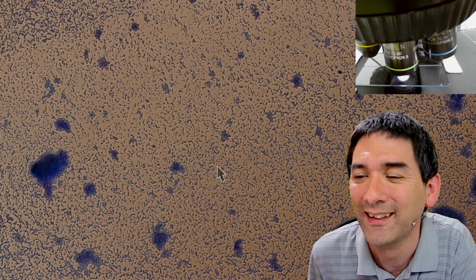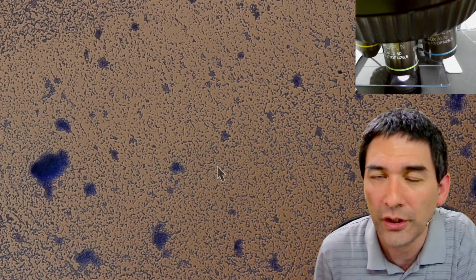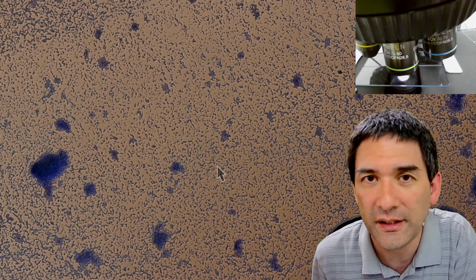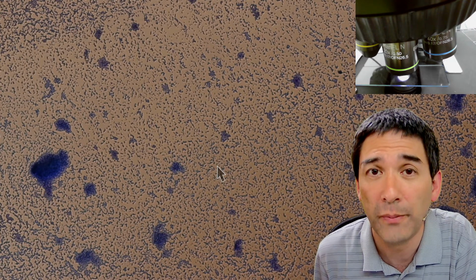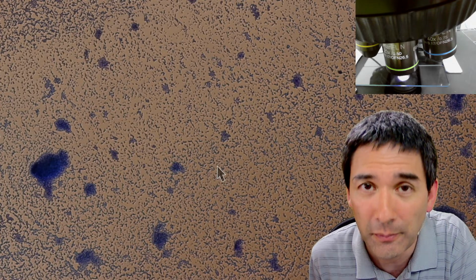The highest level of biohazard is category 4, to my knowledge. Biohazard level 1 is safe. You basically are working with known organisms and they do not cause any problems.